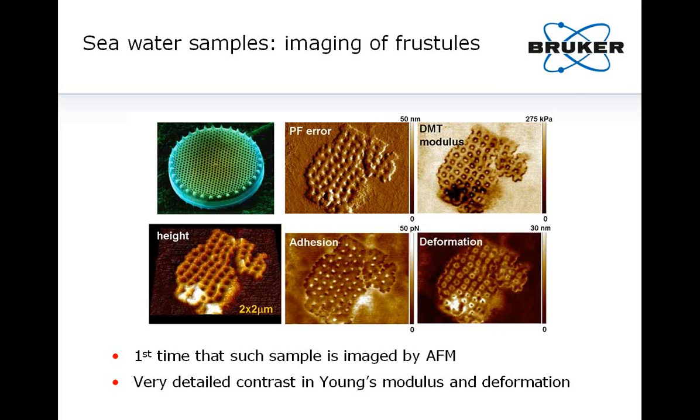So the top left image is an electron microscopy image, a sample courtesy of Dennis Kunkel Microscopy, Inc., where you can clearly see the pores, allowing communication with the external environment. All the rest shown on this slide are AFM images captured by using PeakForce QNM. So the color scales are indicated on the images. The 3D height and PeakForce error channels show a nice resolution.